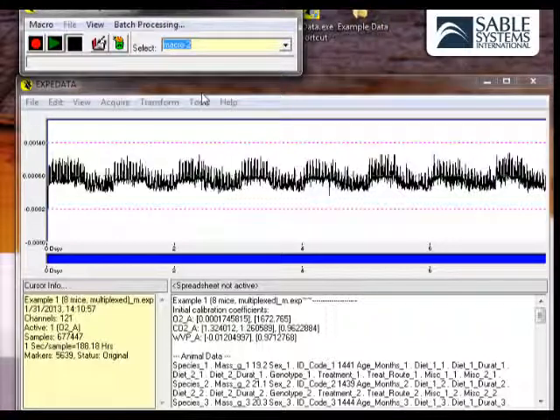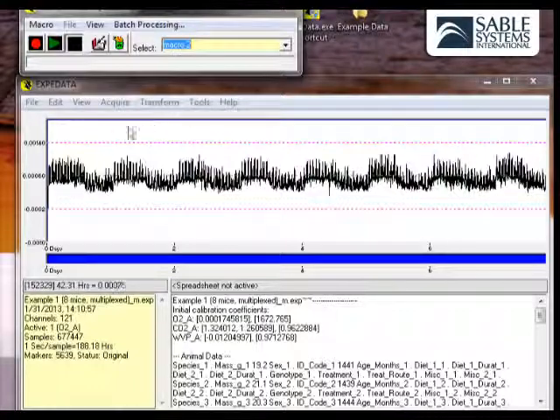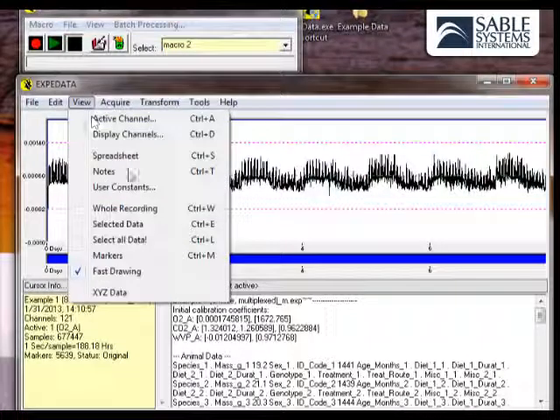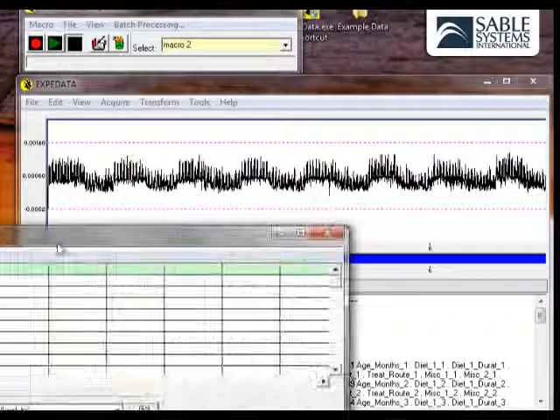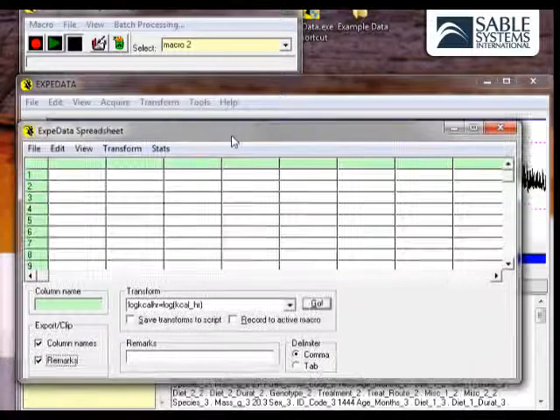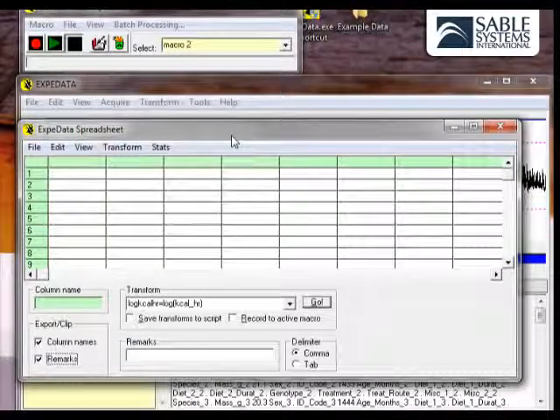Now the actual output of the macro is going to be sent into Expedata's internal spreadsheet. Let's view the spreadsheet by clicking on View and Spreadsheet. And here is the Expedata spreadsheet.